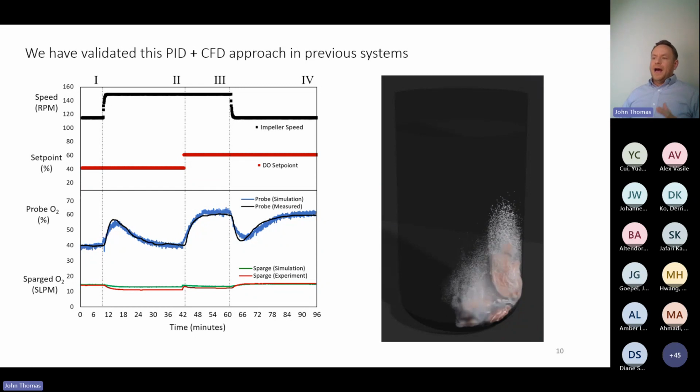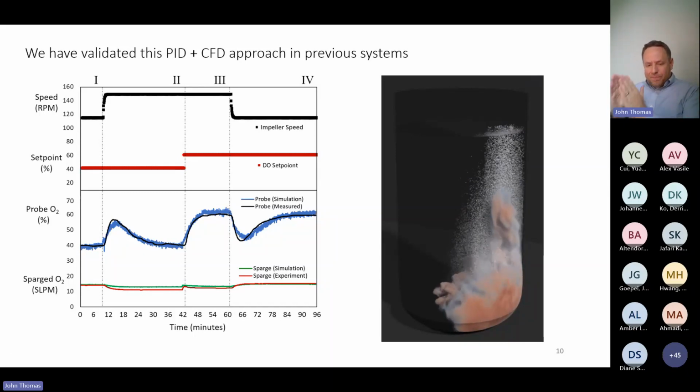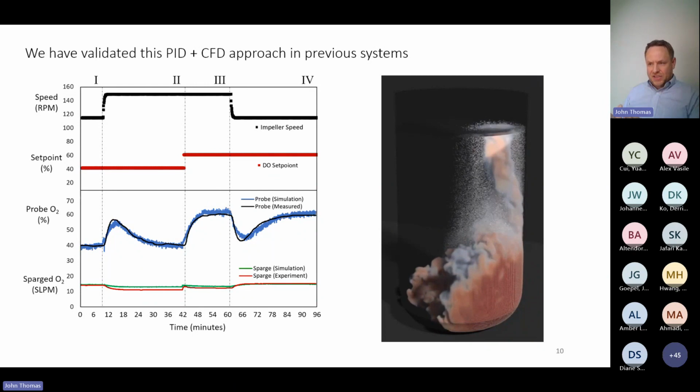There wasn't any nudging of the reaction time or the PID controllers. The PID settings in the simulation were the exact same PID settings used inside the physical system. Same gain, same reset time, etc. The impeller, the shape, the fluid volume, the cell reaction rates, these are the same things, as it were. We use the exact same PID systems.